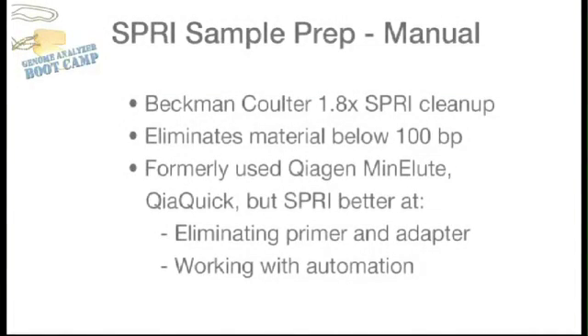This is a demonstration of a Beckman 1.8x SPRIselect cleanup, their recommended cleanup for a PCR reaction meant to eliminate material below 100 base pairs. A protocol is available with every bottle of SPRIselect. We have previously used Qiagen products like Mini Elute Columns and QIAquick Plates, but found that SPRIselect is better at getting rid of primer and adapter and lends itself to use with automation.